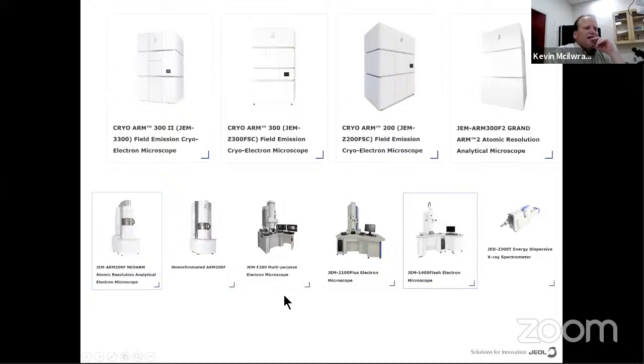So now if we look at actual TEM design and what's happening, my company makes about 9 different microscopes in our standard product line. We've always got collaborations, and all vendors do it, with different companies making these prototype microscopes that eventually will move into commercial production. So you can see these larger TEMs in a box are the cryo models, the high-end materials science ones, and then the little one that I'm on here.